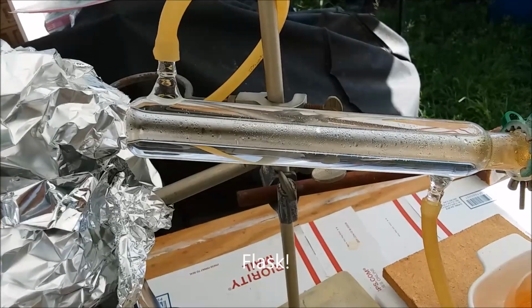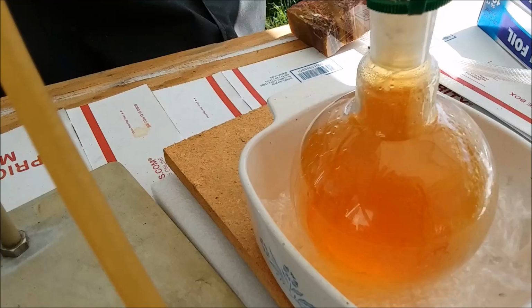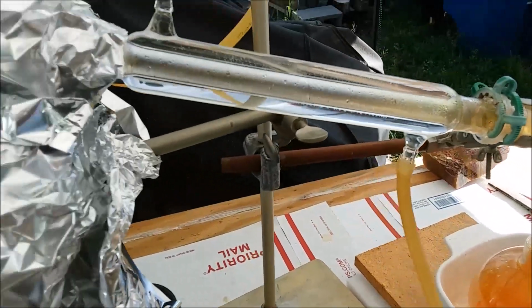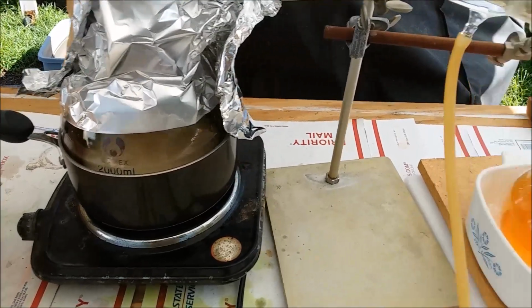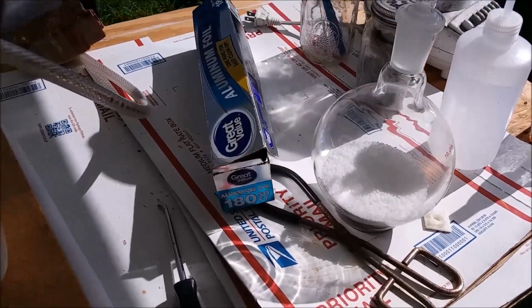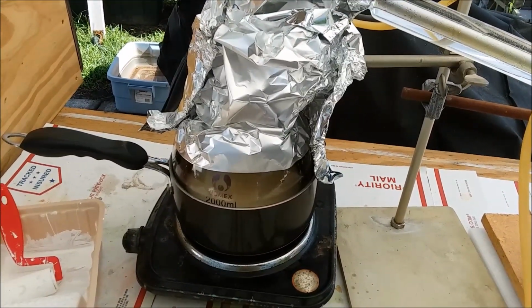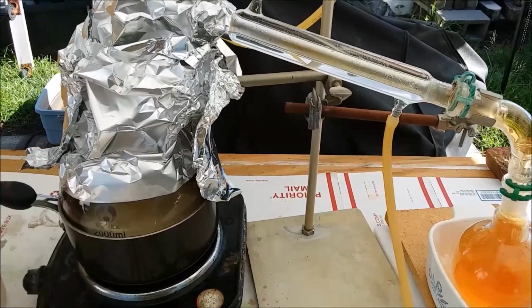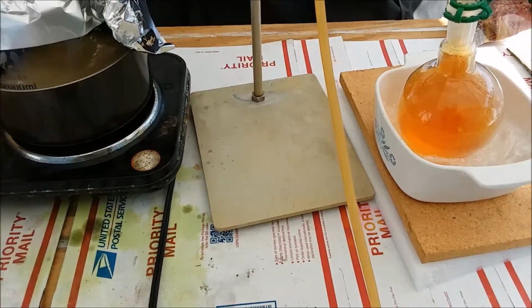Look at the rate the nitric acid is coming over now. Just crazy. But I'll take it. Hey, I'll take as much nitric acid as I can get. And when the reaction does finally slow down and stop, I've got my other boiling flask, my 1 liter one, sitting over here ready to go. And I will just put my personal protective equipment on and swap out the flasks and keep distilling. And I'll only have to clean up this mess once, and I'll get more than double the amount I normally get.